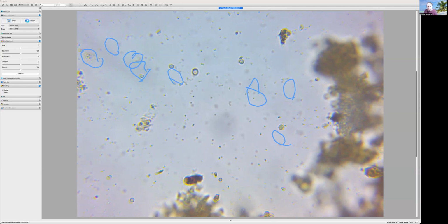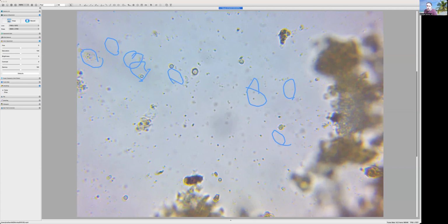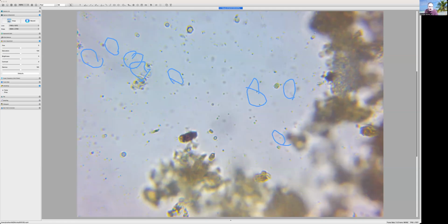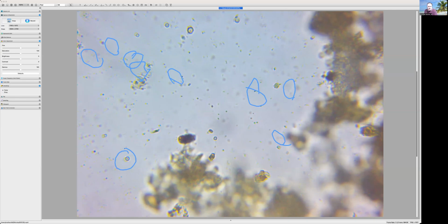Dragging themselves around and all along these aggregates. They're everywhere. It's doing really good. Definitely what we were hoping to see with increasing our protozoans. Now, I do need to start cracking down, and this thing right here has really been going, but it looks like a flagellate cyst.